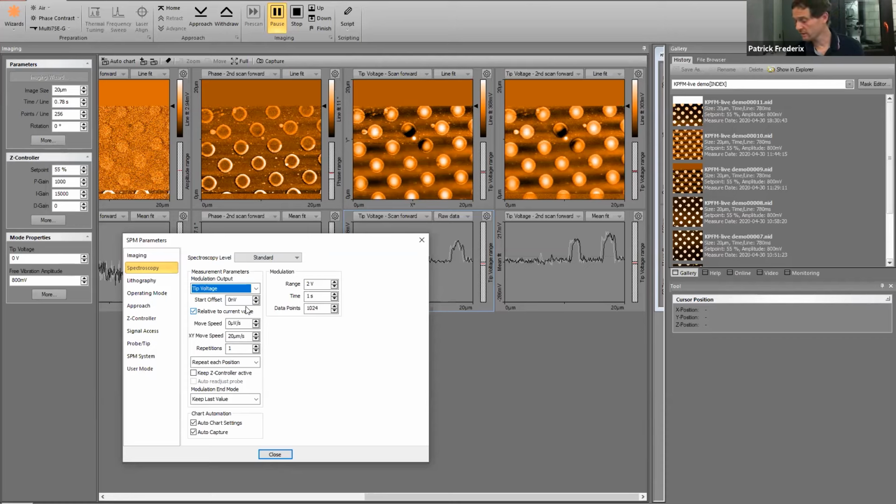I have to say there, the lock-in 2X component will be digitalized, will have been processed through the controller before it's given out, so that's not the direct analog signal. But of course, the tip voltage that is used in feedback comes anyway from the controller, so you can give that out on a monitor.